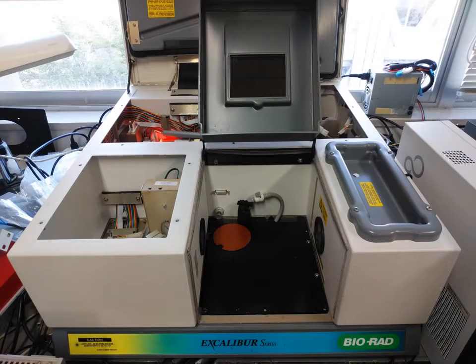There is a light source and an interferometer in this part. Light from the interferometer enters from the right, passes through the sample, and is detected by the detector located on the left. Take a closer look inside.